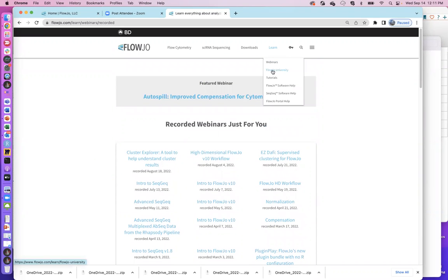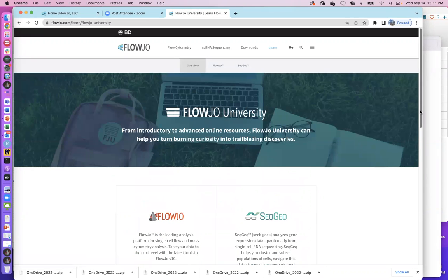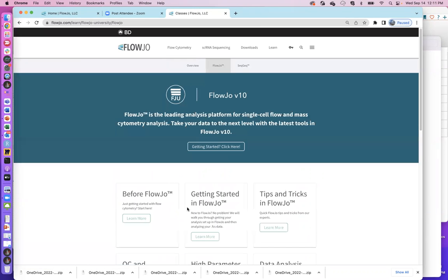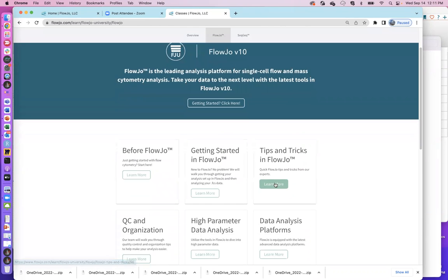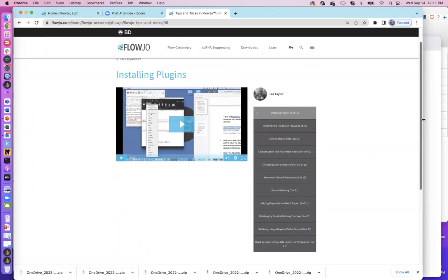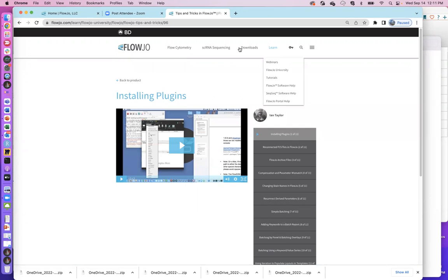On top of that, there are FlowJo University short video tutorials. So you click on the program that you are using, and it has some tips and tricks, a bunch of short little videos that show you different tools in FlowJo, and they're usually like, I don't know, 10-minute videos at most, maybe 15 minutes.